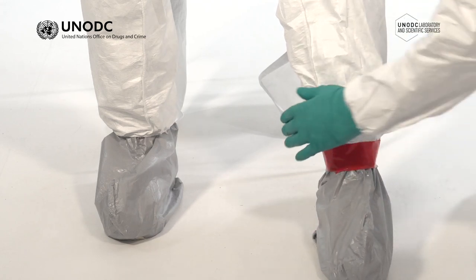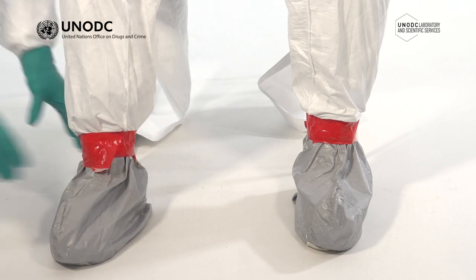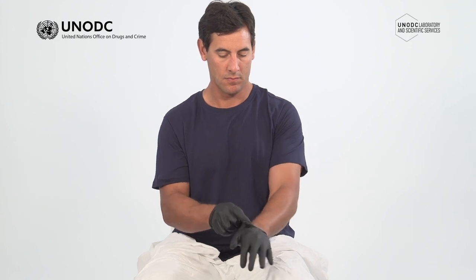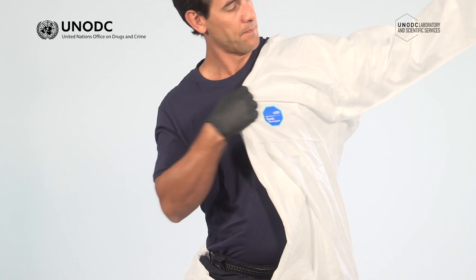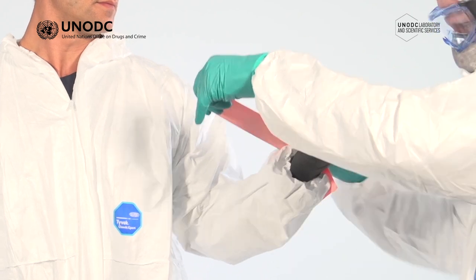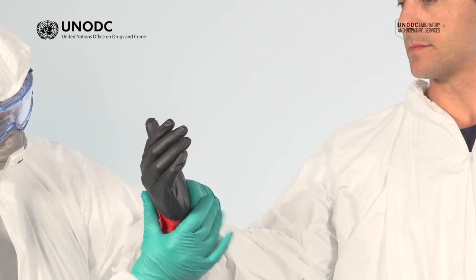Whenever taping boots or other PPE to the coveralls, make a tab by folding the end of the tape over on itself. This will help to remove the tape later during decontamination. Put on a pair of nitrile gloves — these will be referred to as your inner gloves. Insert your arms through the sleeves, lifting the suit up over your shoulders. Inner gloves can be taped to the suit at this point if required. This is particularly recommended if you'll be using double gloves in the work or crime scene environment.